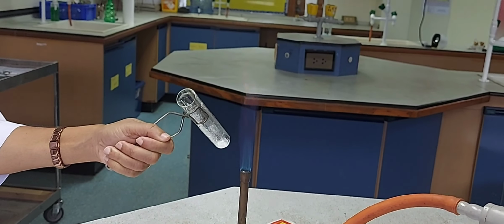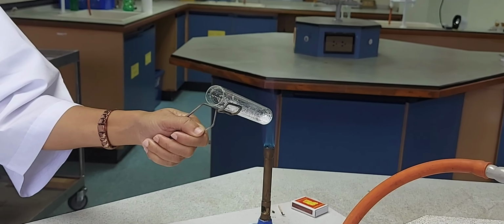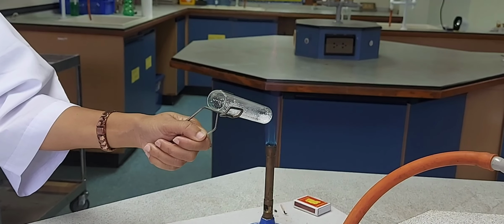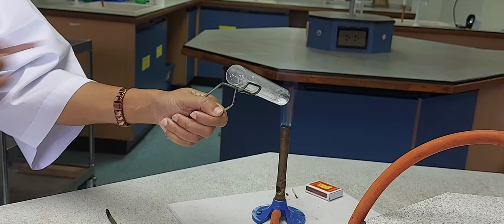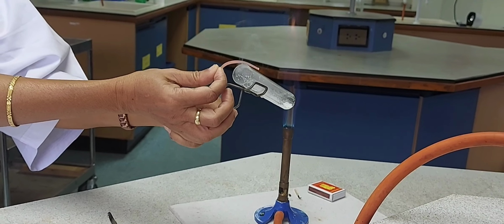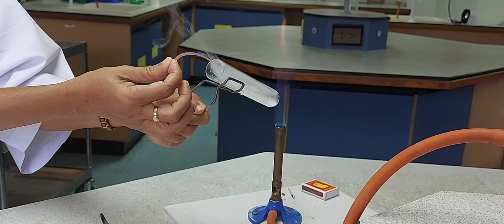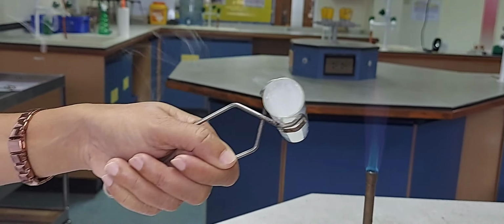Any gas being evolved is tested with a red litmus paper. So again you can see the red litmus paper is turning blue. A gas with a pungent smell is given out, and you have the fumes being formed, white fumes.